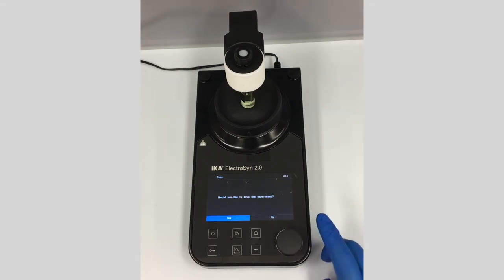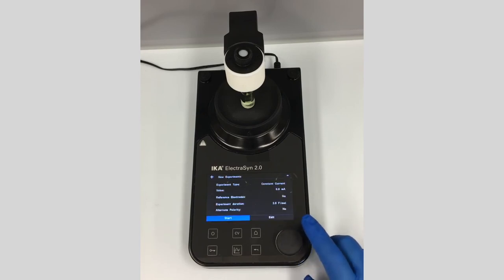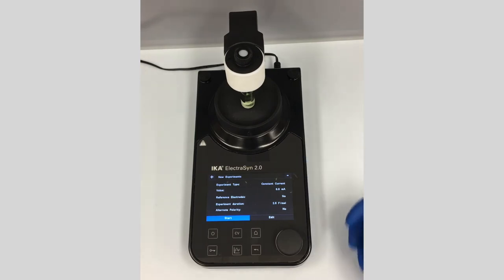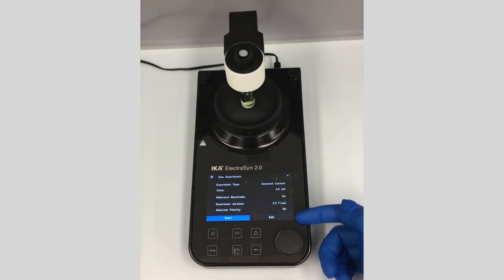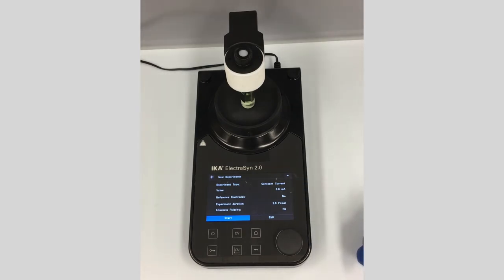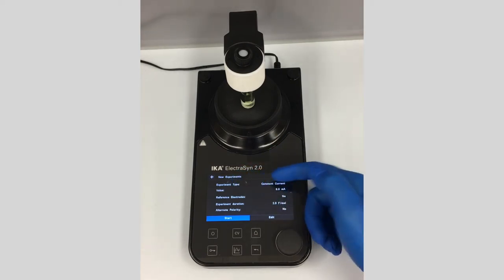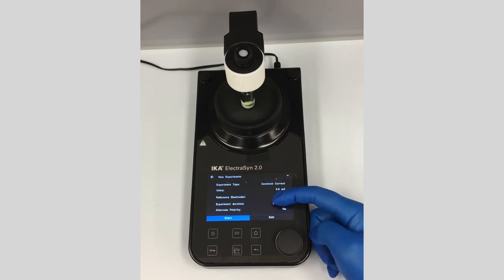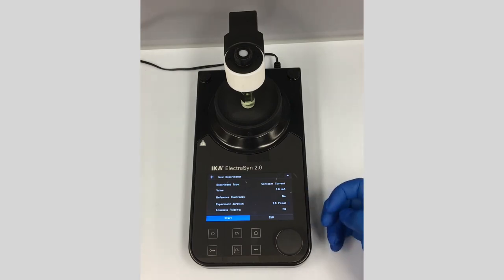You could save the experiment if you want, but personally I think it's easy enough to go through and alter the parameters on your own, so we're not going to save it. After that, we get to the pre-reaction running screen, which is the same for all reactions run with the ElectroSyn. It tells us all our parameters: experiment type is constant current, value is 8 milliamps, reference electrode is not being used, and duration is based on the 2.5 Faradays per mole correlated to the millimoles inputted earlier.